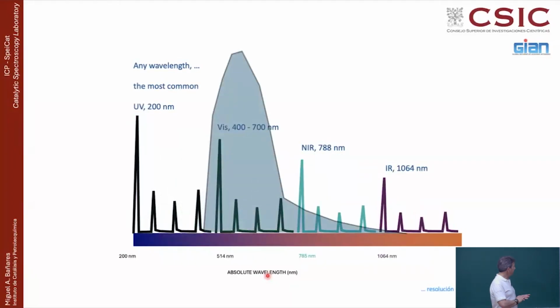And this big thing in the middle of the spectrum is fluorescence. When the sample has fluorescence, you have a problem, particularly when you are working in the visible region, because fluorescence is something that we typically see, something that happens in the visible region. So if you have a sample with fluorescence and you are using visible lasers like green or red, the fluorescence will be a problem. And it will be a very important problem. Remember, 10,000 times stronger than the Raman effect.